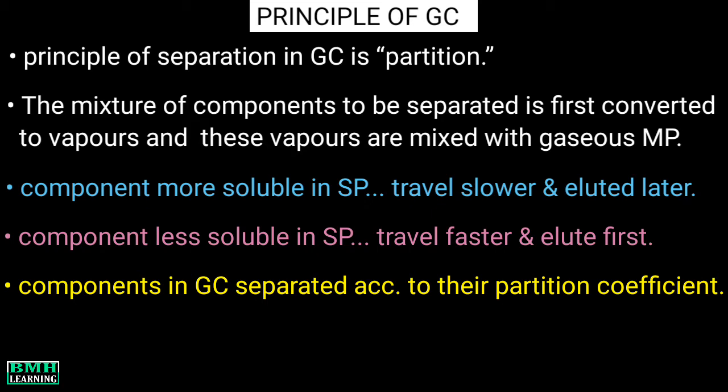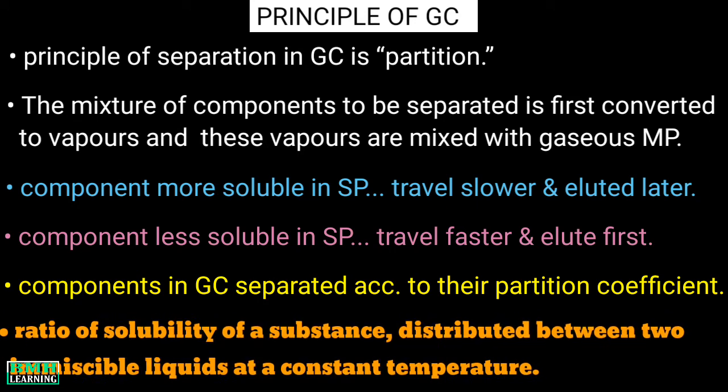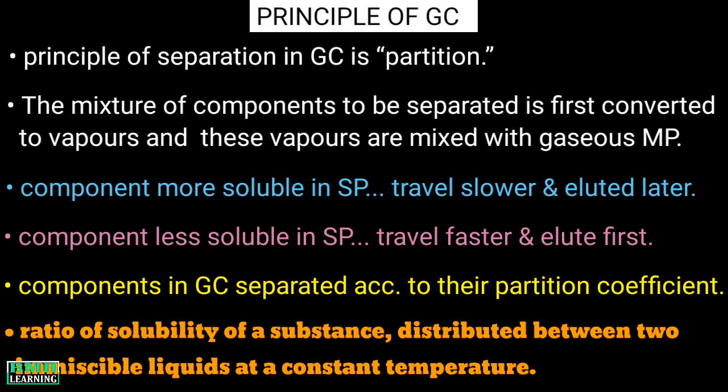Now, what is this partition coefficient? Partition coefficient is the ratio of solubility of a substance distributed between two immiscible liquids at a constant temperature.